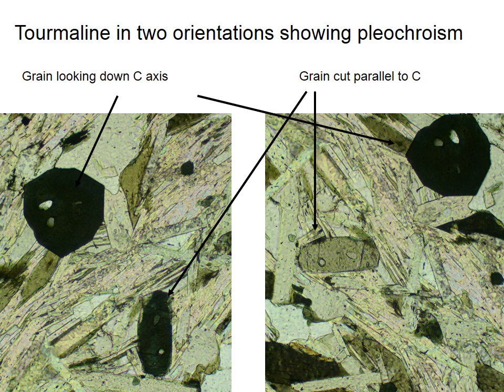So you could orient this one so that it is at extinction with the analyzer in, and then test the two colors, which looks like it's been done here. The orientation on the left shows a color similar to the vertically oriented grain, so that should be showing the ordinary ray. And the extraordinary ray orientation on the right receives no light from the lower polarizing filter, so all you're seeing is the other ray.